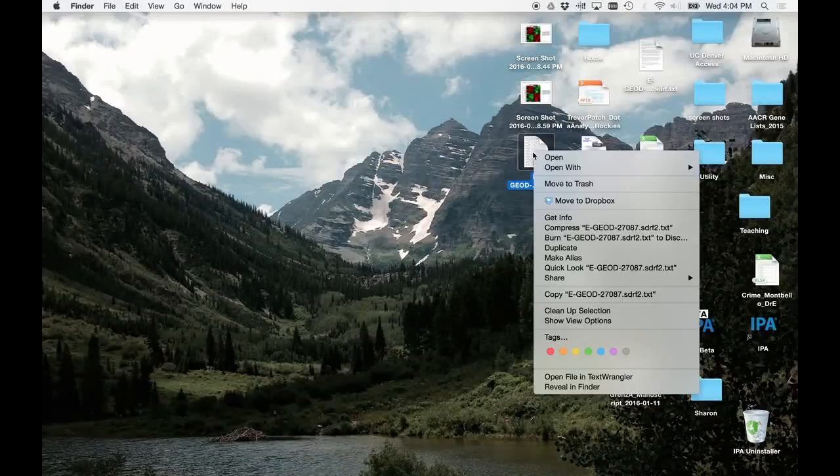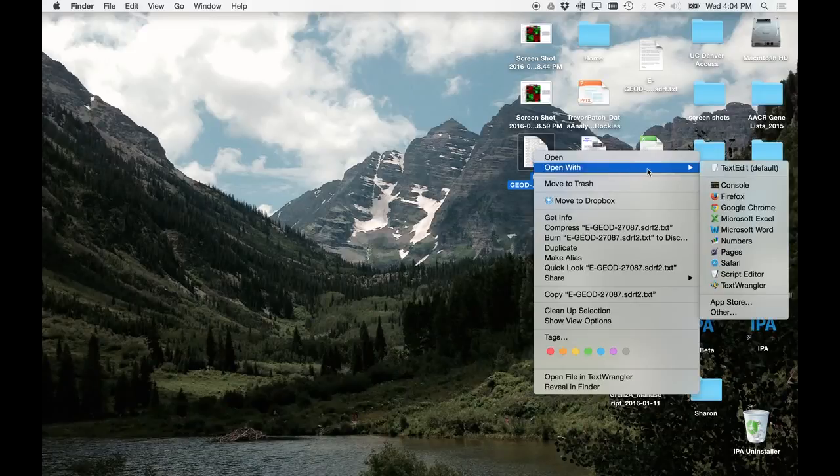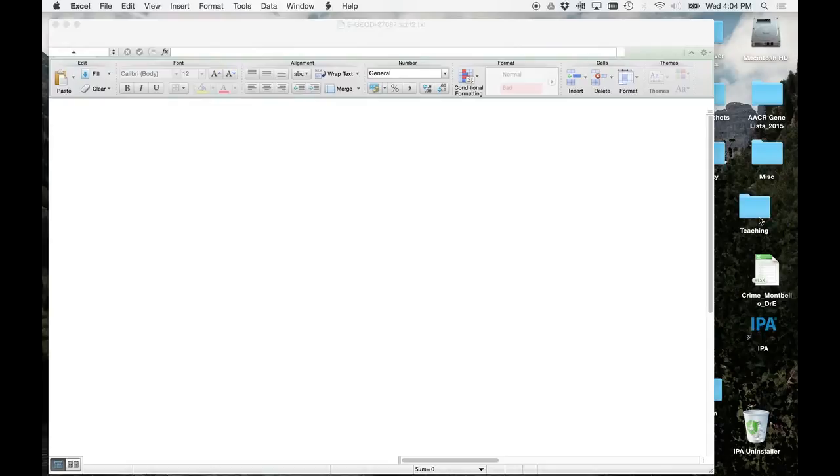So we want to open this with Excel. Here is what I have found is my most used program, probably for what I do, is Excel, hands down. And I've talked to many biostatisticians and computer people that say, oh, you can't use that because of some kind of control, blah, blah, blah. Heck with that. It works, and it works really well. And everybody has a copy of Excel. So open this with Excel.